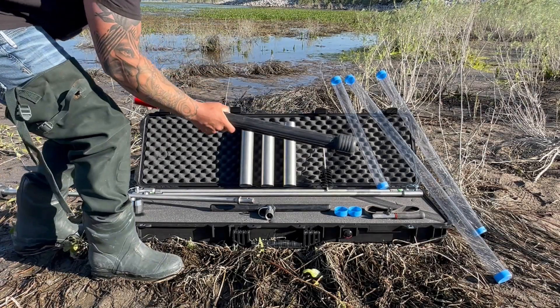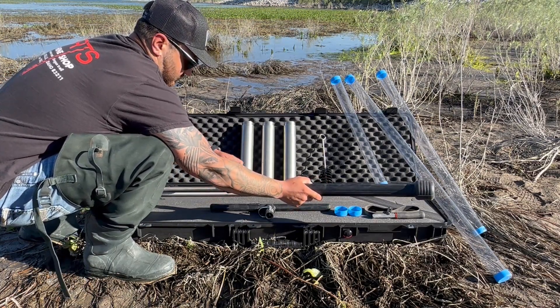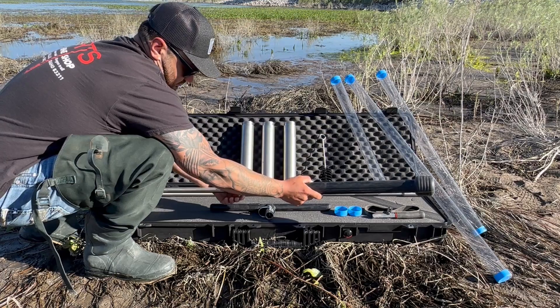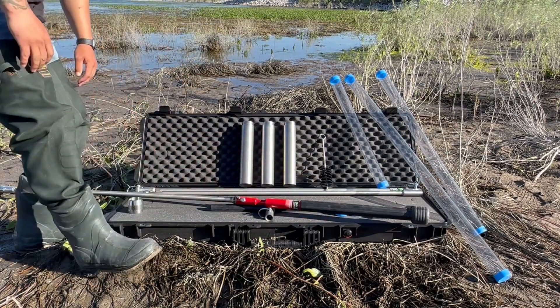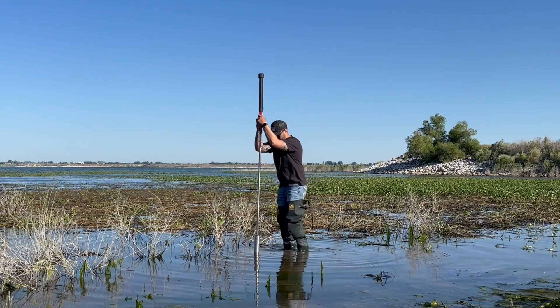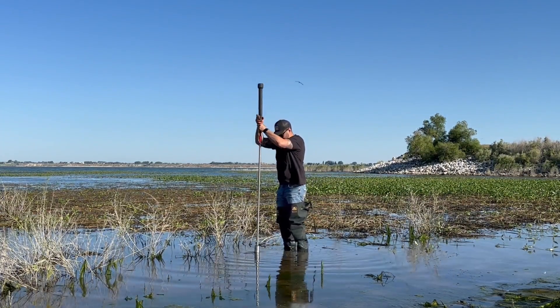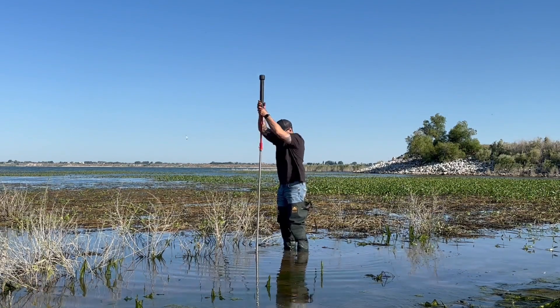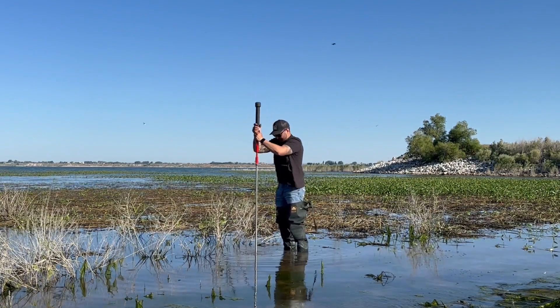Once the extension is connected, it is time to connect the slide hammer to begin the sampling process. To drive the sampler into the sediment, pull up on the slide hammer and then pull down to create a driving force. With repeated actions, the sampler will go deeper into the sediment, effectively collecting your sample.